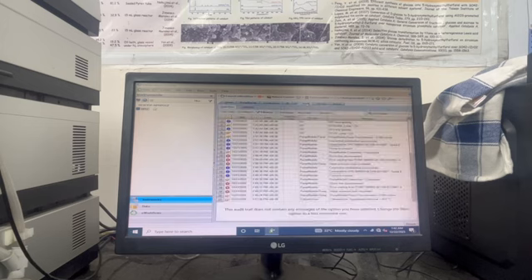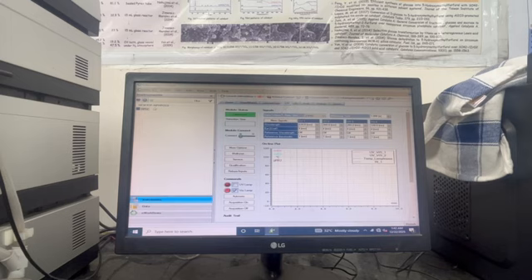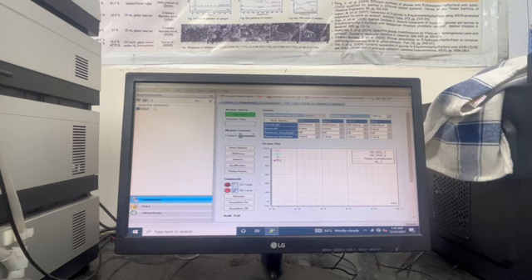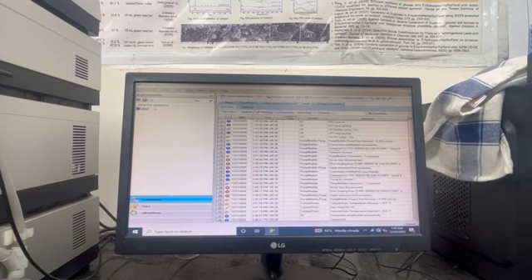So in the audit we can see the UVVs lamp ignite, so ignition happens. Once it's ready, these two ticks will show. In this ticking, you have to click only one time, you don't have to repeat the clicking. This UV lamp, especially the upper one, will take a little more time to turn on, so you can leave it. Then now this lamp is on, so we are waiting for the UV, and it will come after some time. So this is the way.